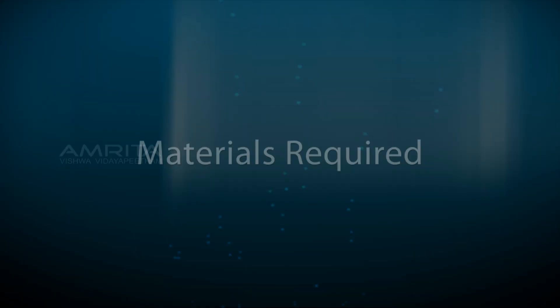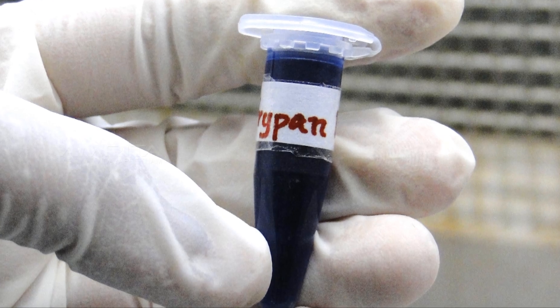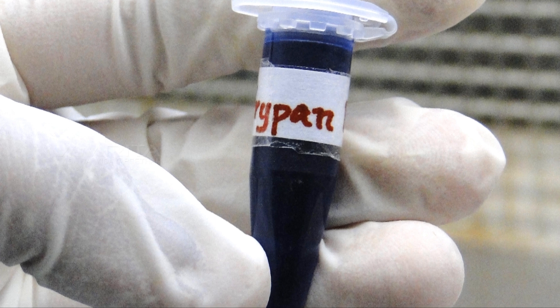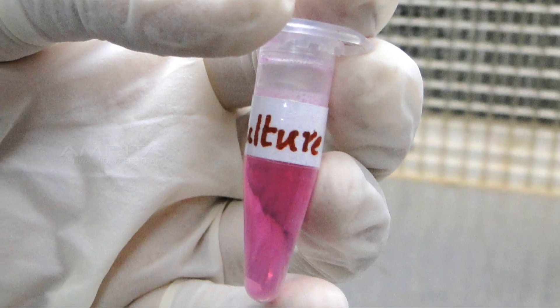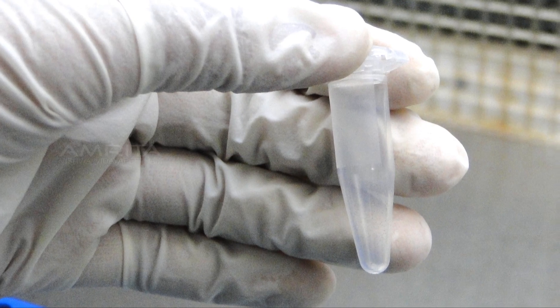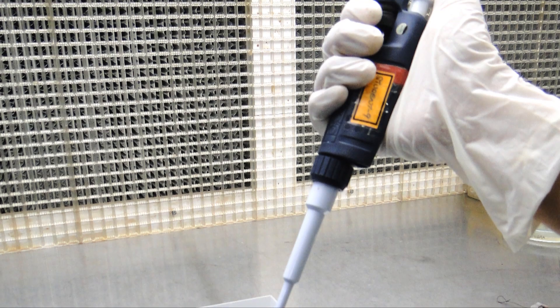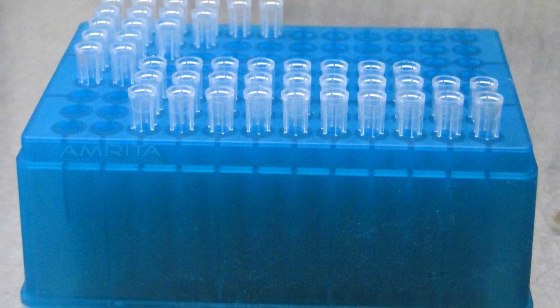Materials required for the experiment: 0.4% trypan blue stain, uniform cell suspension, fresh vial, micro pipette, pipette tips, and vial rack.